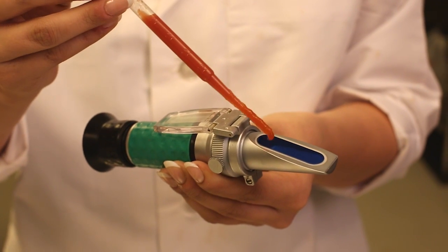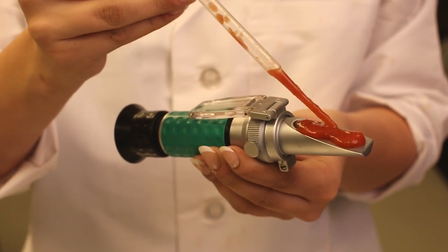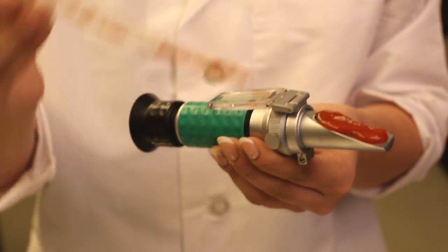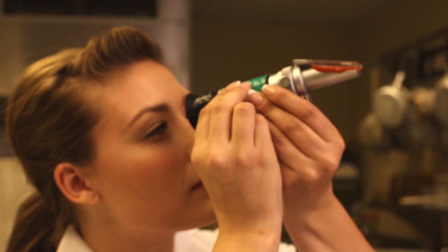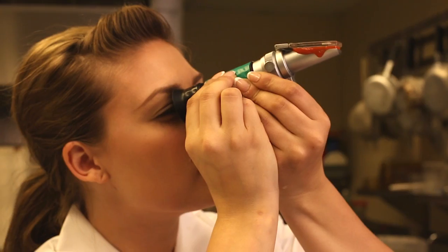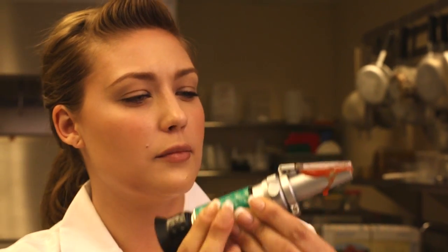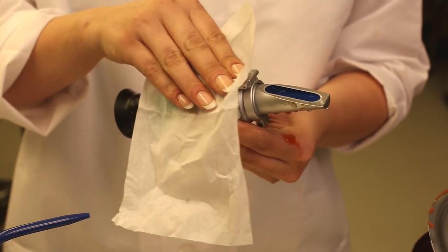Next, we apply the product we will be testing to the prism. It is important to cover the entire prism, making sure there are no air pockets or gaps. Next, we close the daylight plate and look into the light. At this point, we should see the scale reading go up from zero to the actual reading of the percent of tomato solids. Once this test is complete, the prism should be cleaned with distilled water and the prism dried with the wipers before putting away the unit.